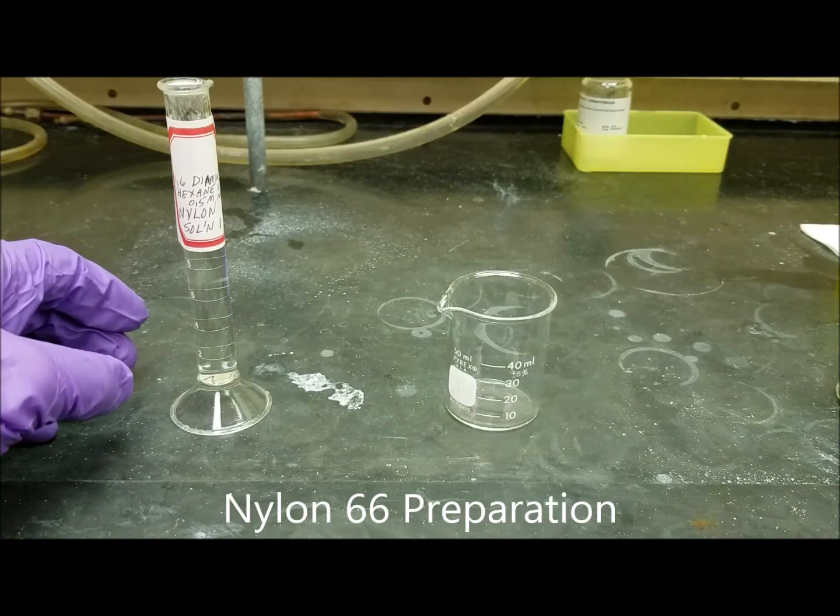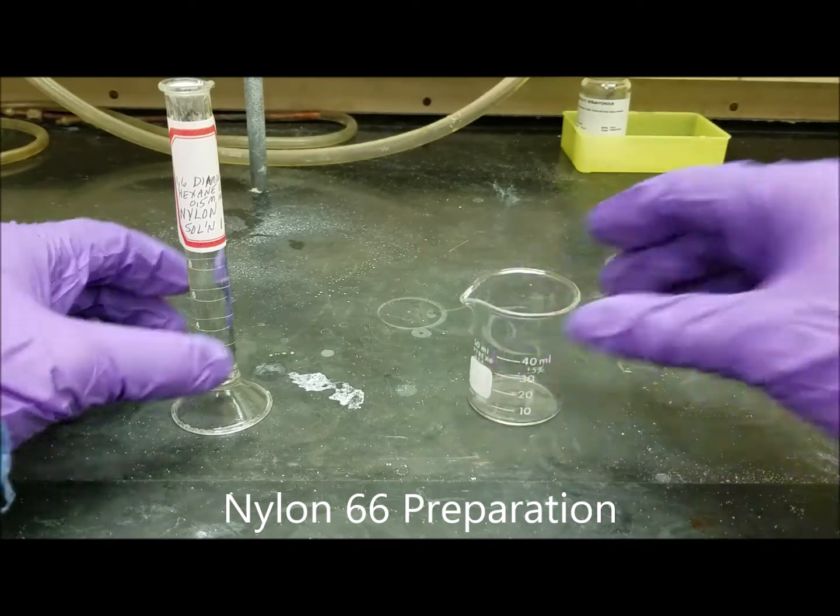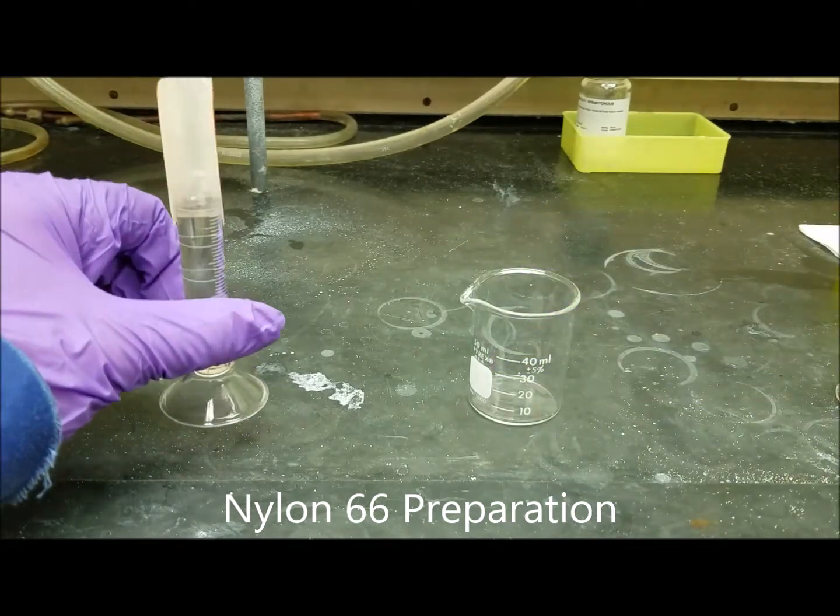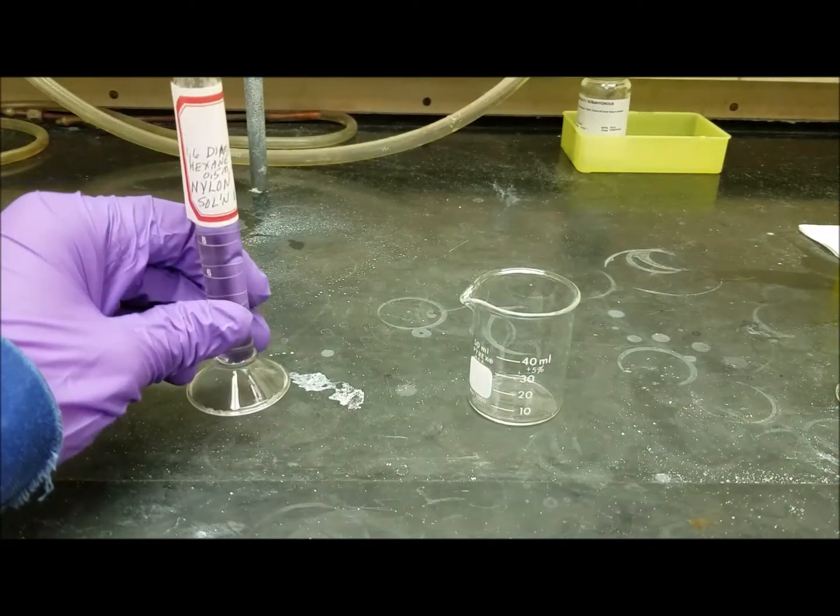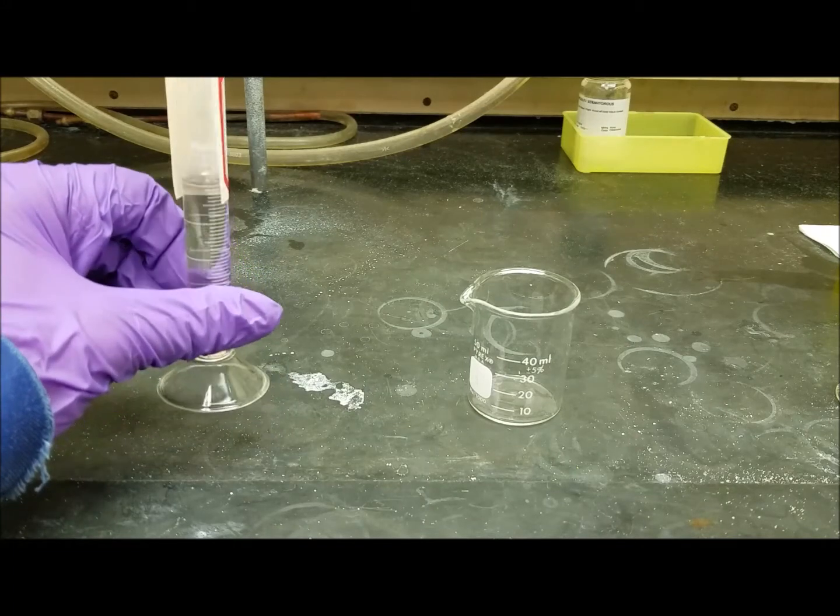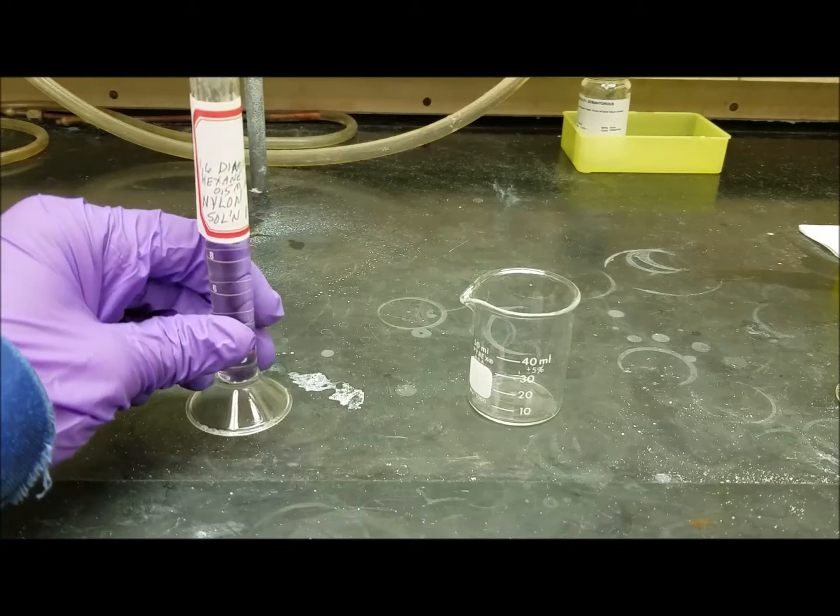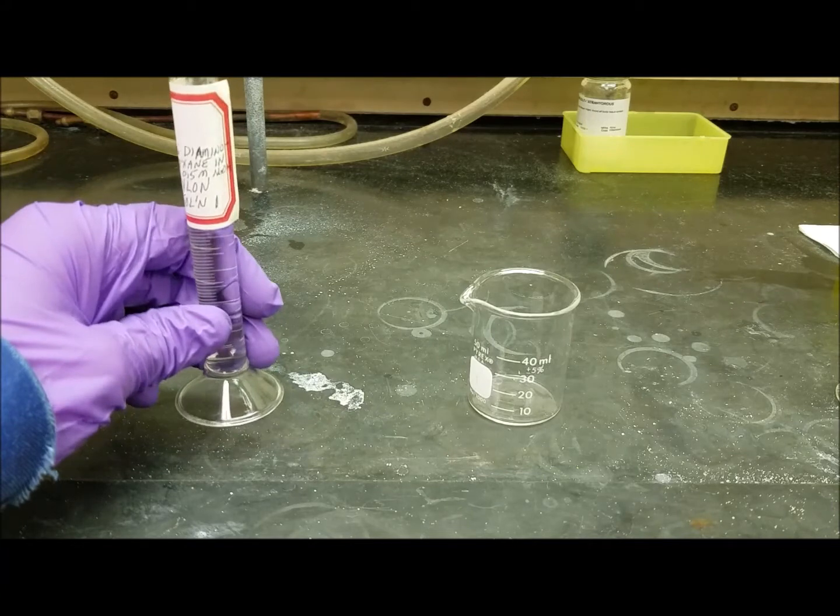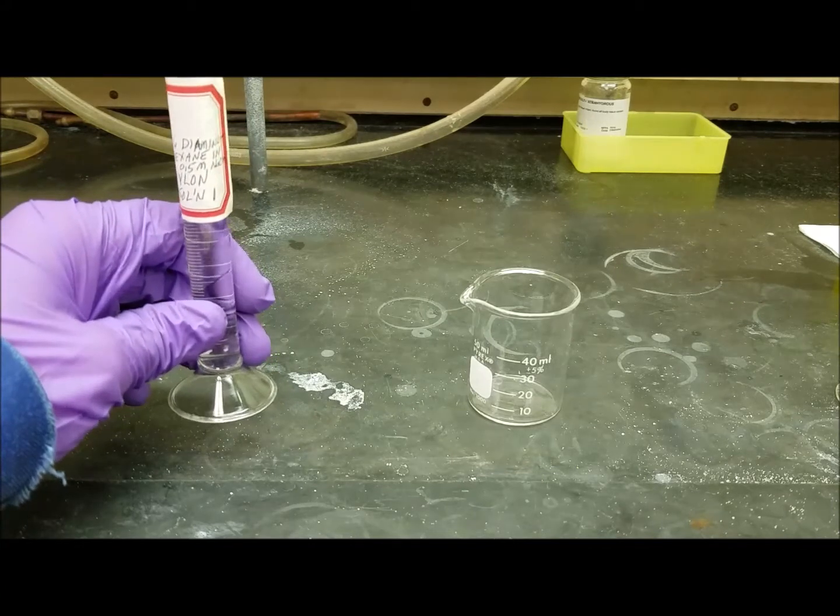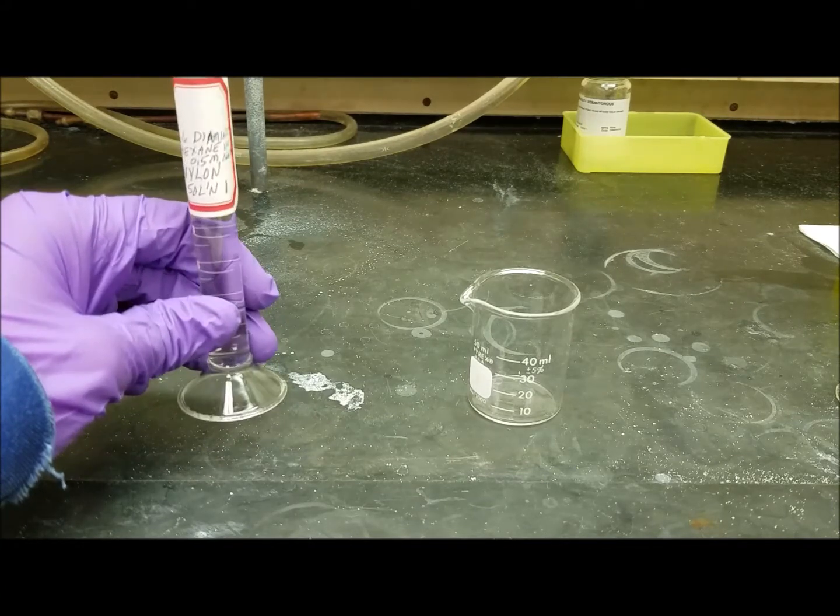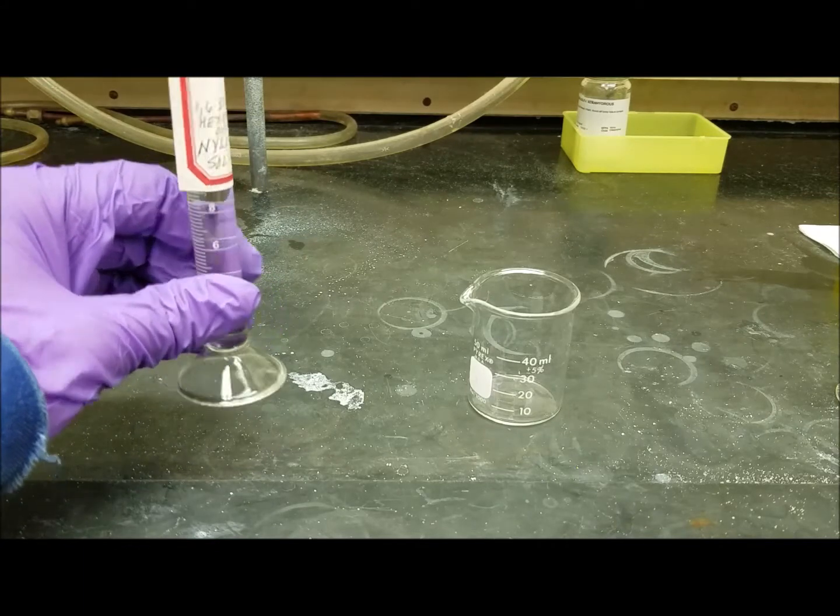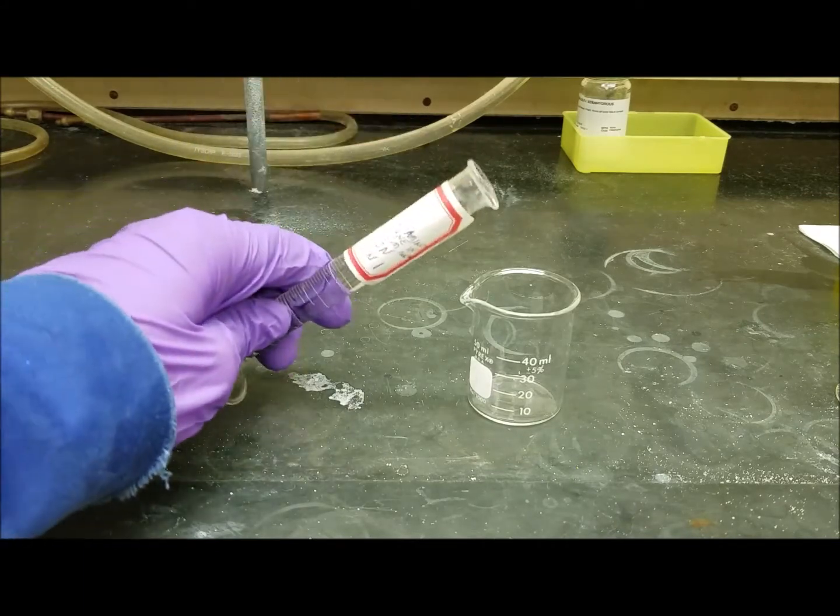Okay, so here I have a beaker, a 50-milliliter beaker, and a 10-milliliter graduated cylinder. And this is filled with 10 milliliters of 1,6-diaminohexane. And it also contains 0.5 molar sodium hydroxide. And the solvent here is water, so it's an aqueous solution.